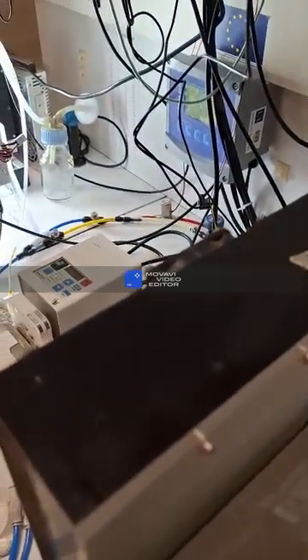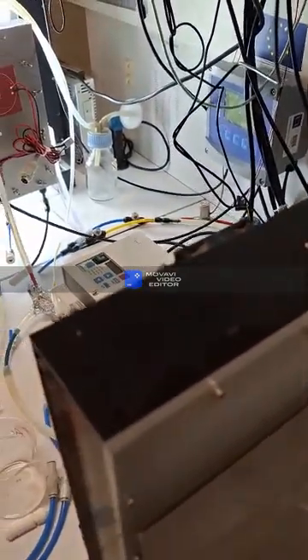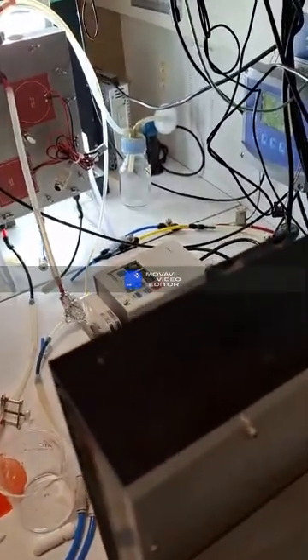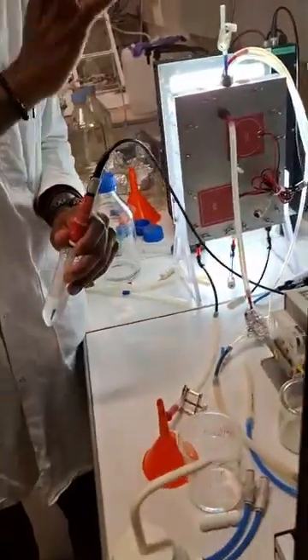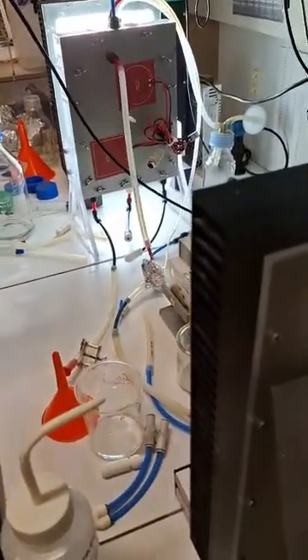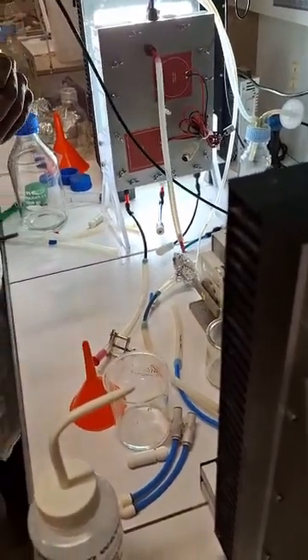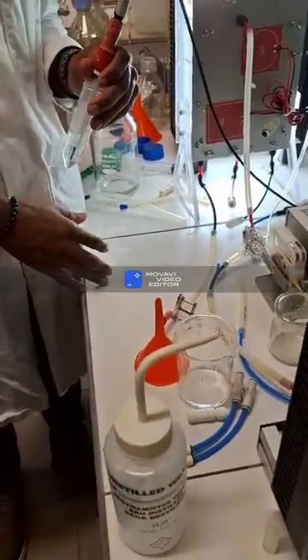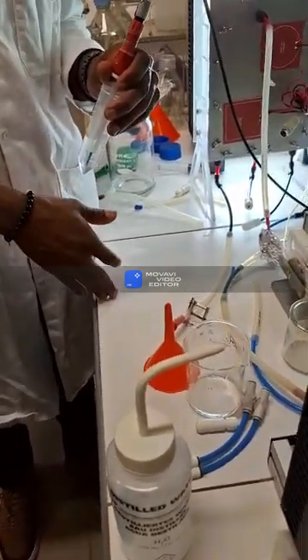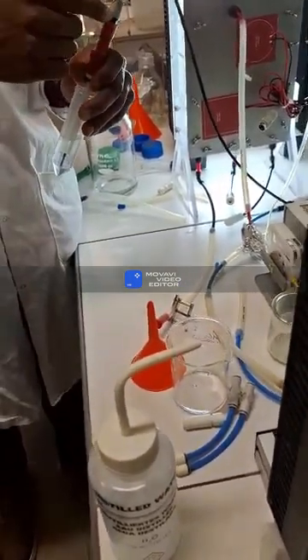Why should we need this? Like, why do we calibrate it? Because the pH of your PBR, your culture, will be monitored by this probe. For example, for freshwater green algae, you have to be between 7 or 7.5 for pH.